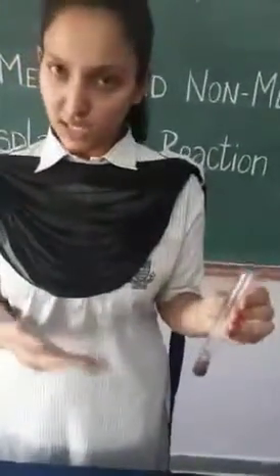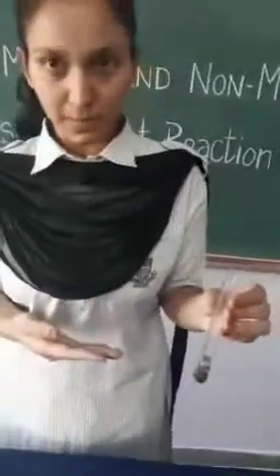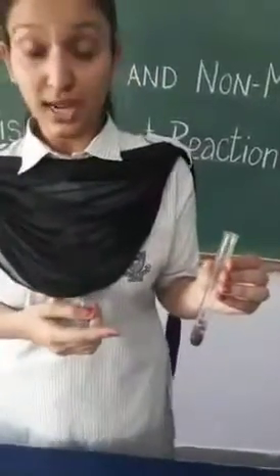And in test tube B, the copper sulphate solution turns transparent and brown deposition settles at the bottom.